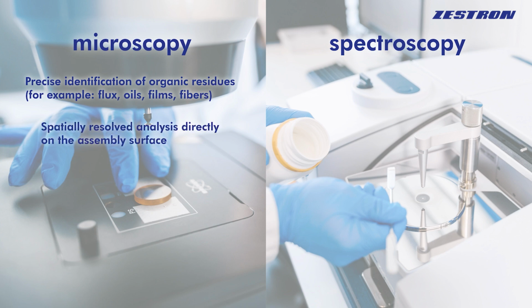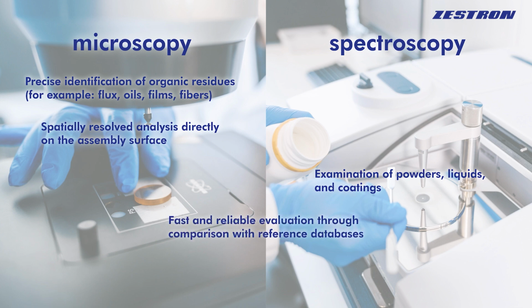Spatially resolved analysis directly on the assembly surface. Examination of powders, liquids, and coatings. Fast and reliable evaluation through comparison with reference databases. Clear results and comprehensible reports with expert interpretation.